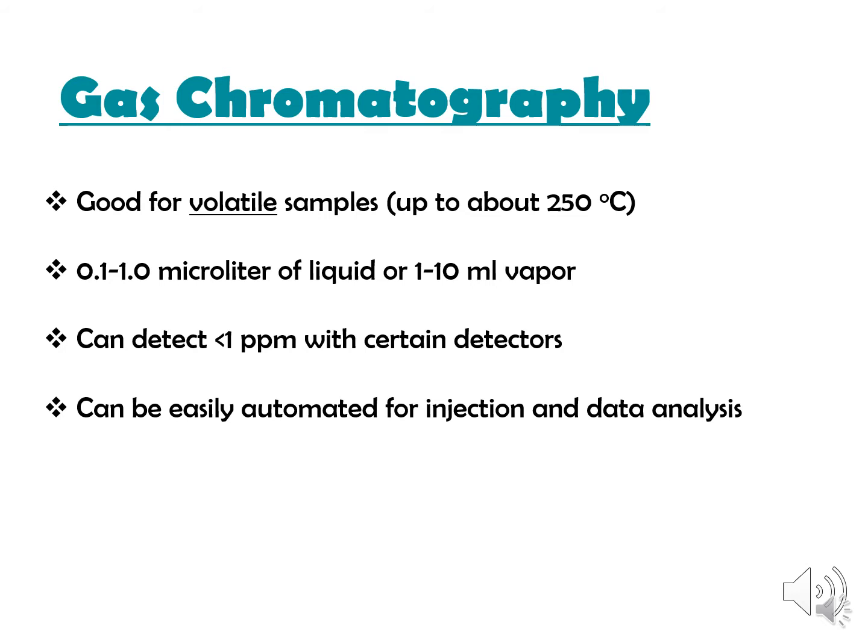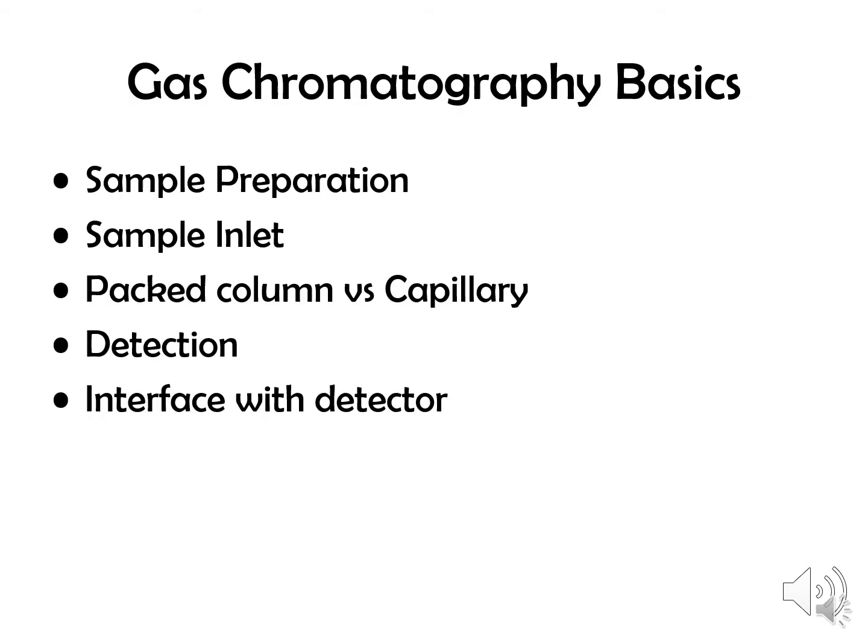And gas chromatography can lend itself easily to automation for injection and data analysis. So in gas chromatography, we have to worry about sample preparation. Not everything is able to be just put right in a GC.